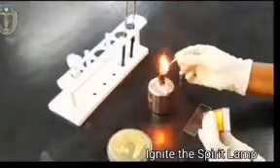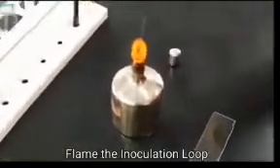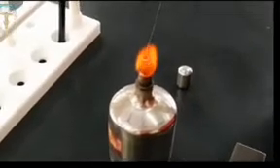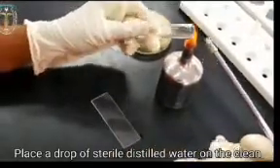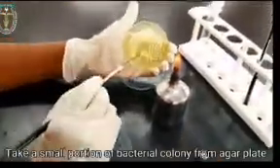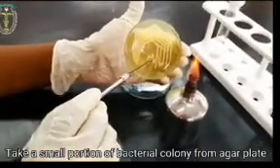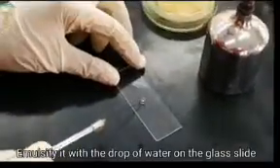So the steps: first, ignite the spirit flame, and then flame the inoculation loop and allow it to cool. Next, take a clean microscopic glass slide and place a drop of sterile distilled water on it using the inoculation loop. Then take a small portion of the bacterial colony from the agar plate and emulsify it with the drop of water on the glass slide.